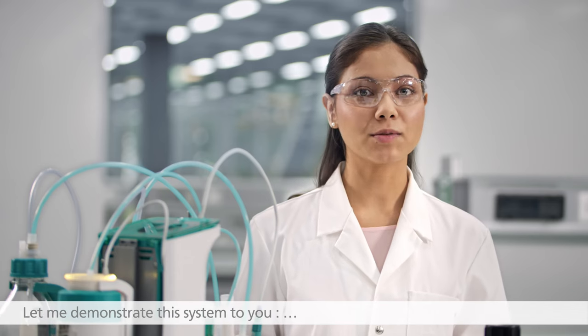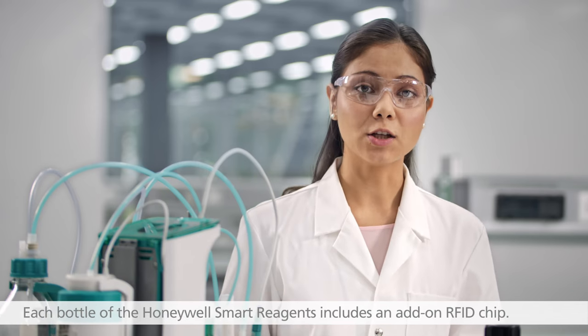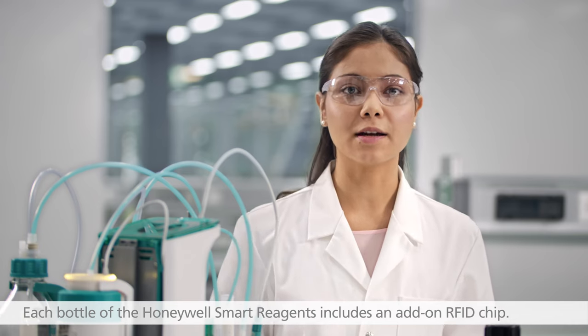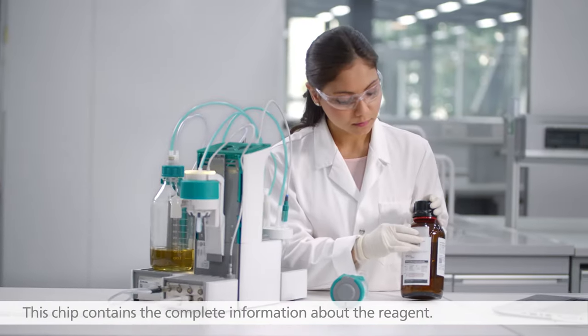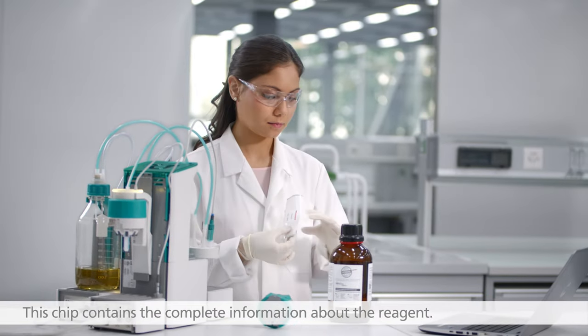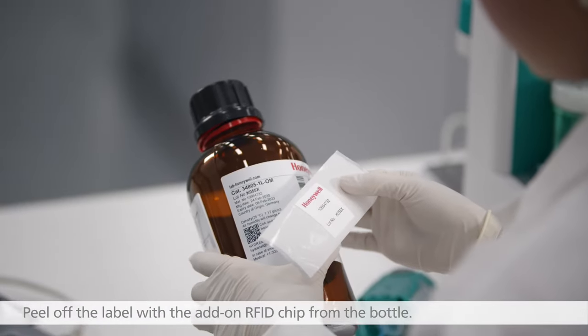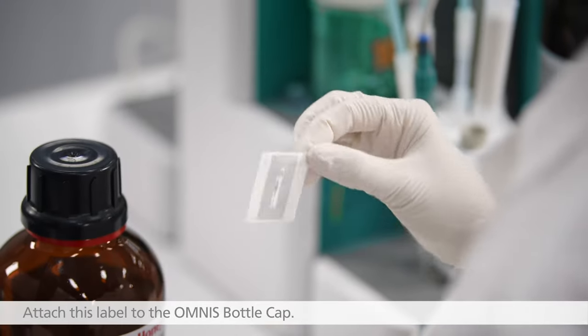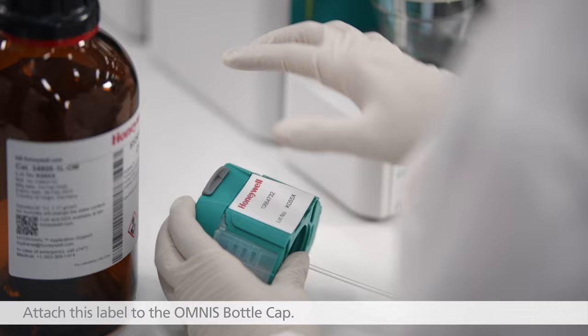Let me demonstrate this system to you. Each bottle of the Honeywell Smart Reagents includes an add-on RFID chip. This chip contains the complete information about the reagent. Peel off the label with the add-on RFID chip from the bottle, then attach this label to the Omnis bottle cap.